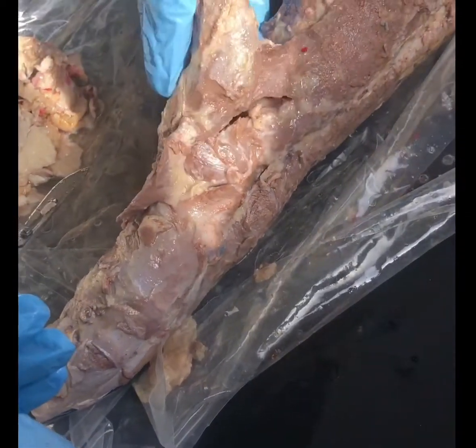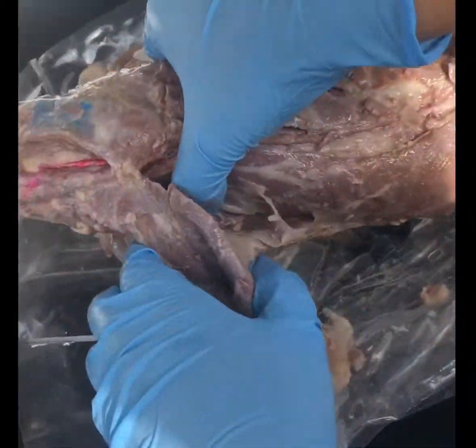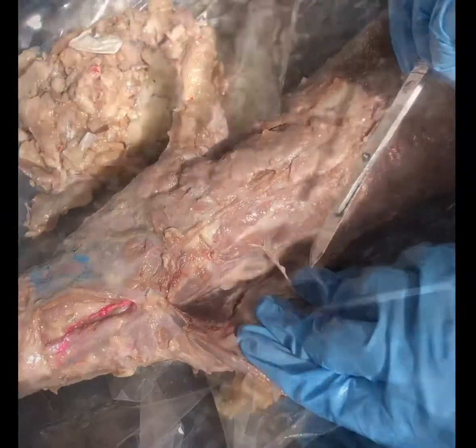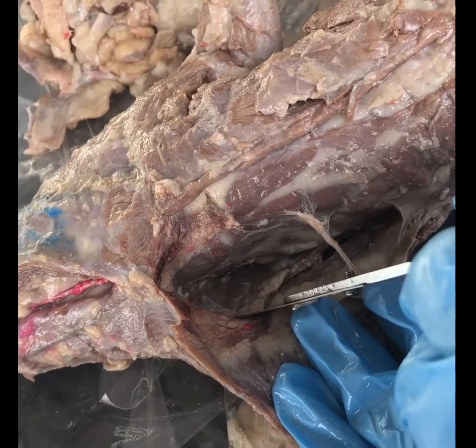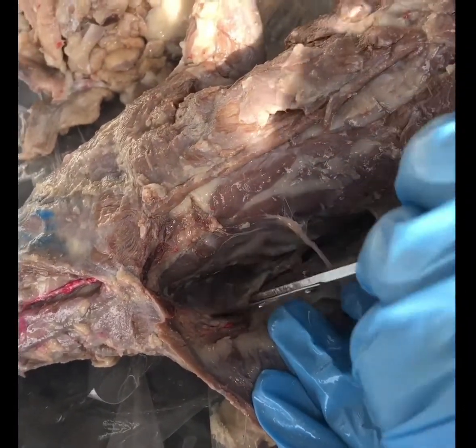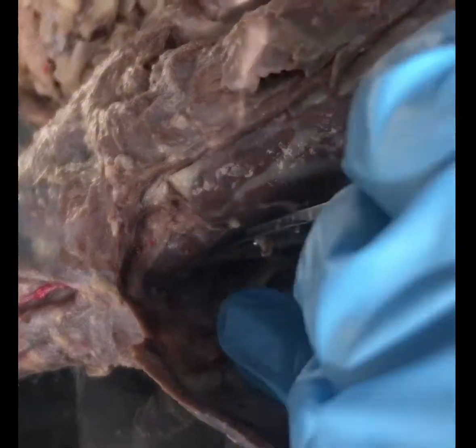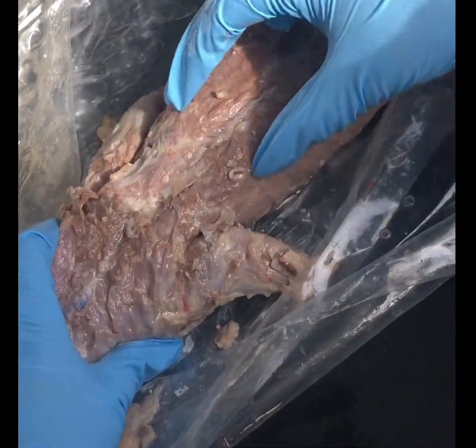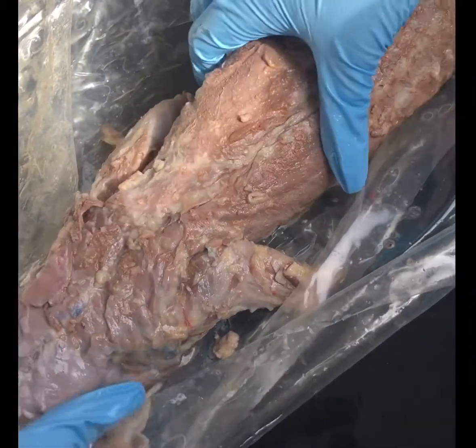subscapularis is on the inside. So we go here into the scapula. It's gonna be right here. Okay, the subscapularis is right here. This muscle right here on the inside, under the scapula. Okay, the erector spinae is basically the muscle that covers the spine, which is all this right here. The outside, the outer muscle.